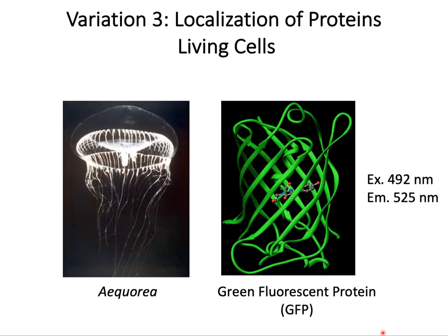The last indirect immunofluorescence technique that I have talked about is with fixed cells. And fixed cells are dead as a result of fixation, which is required to permeabilize them so that large antibodies can get into the cell.